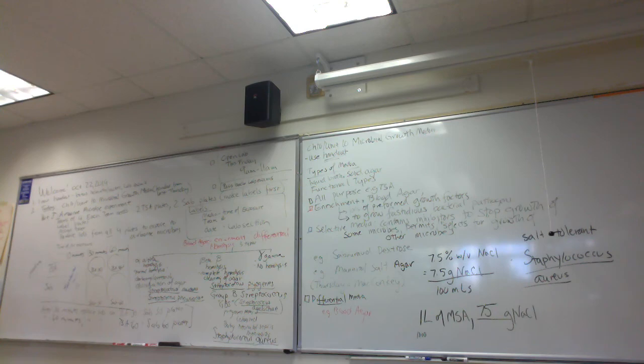So hemolysis, the ability to cause lysis of red blood cells, is a pretty unusual property, right? So most microbes are going to be what? Gamma hemolytic, and how would that appear? No change in the agar, right? No lysis of the blood cells. Good. You guys are awesome.